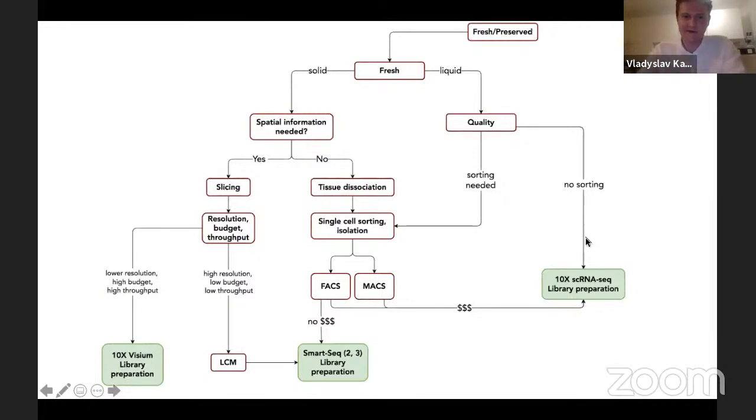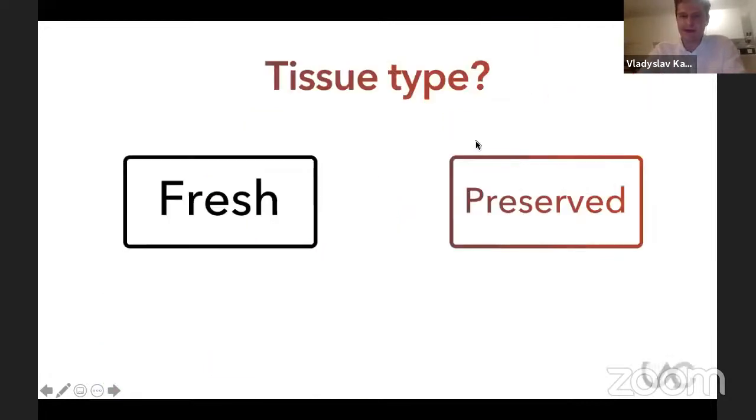But that is something that it's very good that you ask, because this is the next part of our workflow today, namely, what happens if you have the preserved tissue? So what happens if you have tissue that was frozen before, or processing the other way? Well, let's talk about the processing with the preserved tissue. And this is something that can vary a lot, that you can try with some alternative methods and that might be developing really fast in the next years.